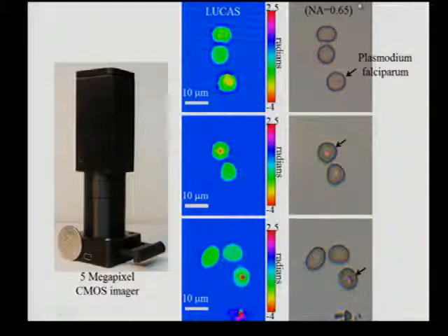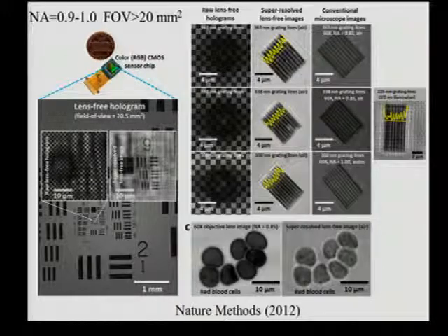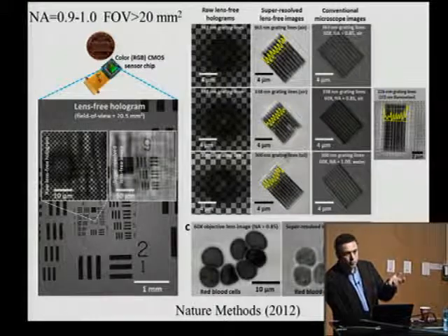And this is the comparison, which gives you essentially a nice feel of how it compares with a traditional light microscope. If you were to use a state-of-the-art sensor, not that older generation that I've shown you, you can actually create some very competitive images across very large fields of view. This is showing a sensor which has about 20 millimeter square active area, 4 by 5 millimeter in width. And it has a pixel size of about 1.1 micron.